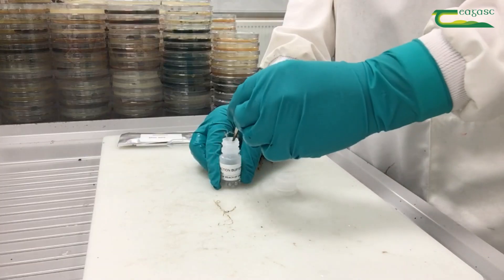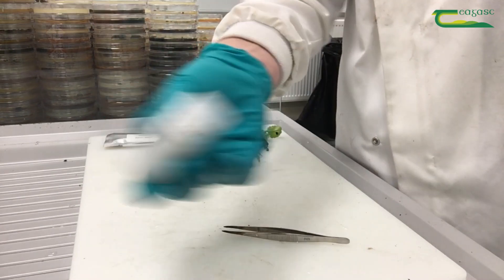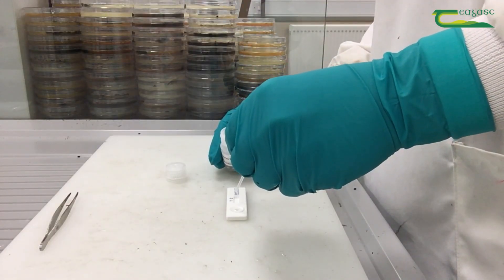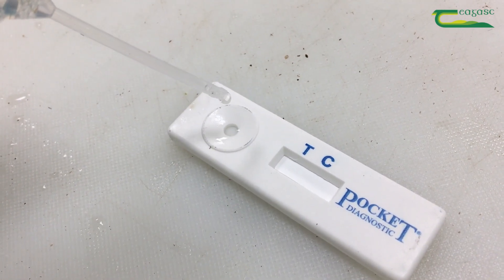Take these root pieces and place them in the extraction buffer. Then shake the container for 30 to 60 seconds to break up the sample. Using the pipette, place two or three drops of the extract into the lateral flow device well.